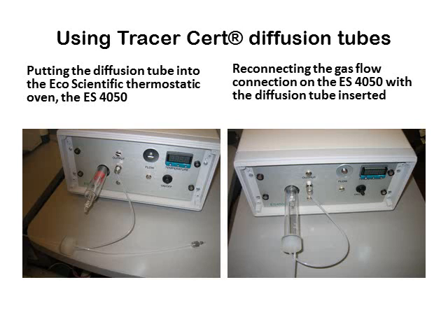The latter output tube can be connected to whatever device the user may wish to calibrate. The carrier gas could be zero air, purified clean air, or, when working with oxygen-sensitive compounds, oxygen-free nitrogen, for example.